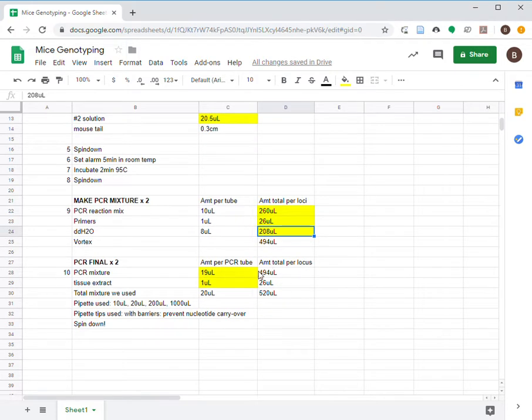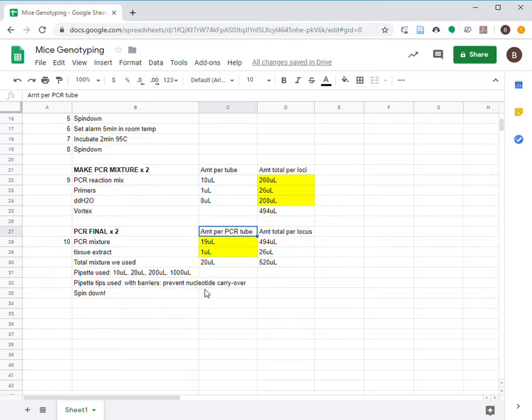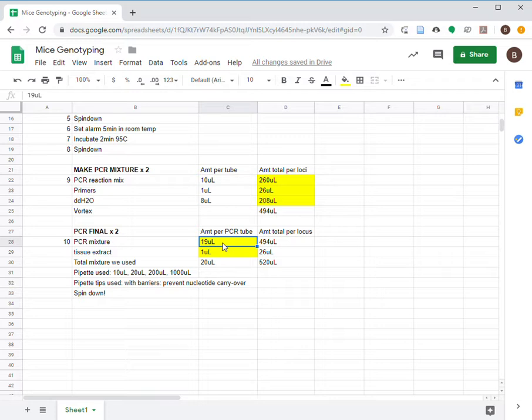Finally, we prepare the PCR tubes. We'll also do two sets for a total of 48 PCR tubes. Label and arrange the PCR tubes before beginning to work with the solutions. Into each of the PCR tubes, add 19 microliters of PCR mixture and 1 microliter of tissue extract.